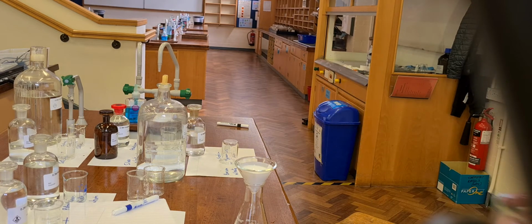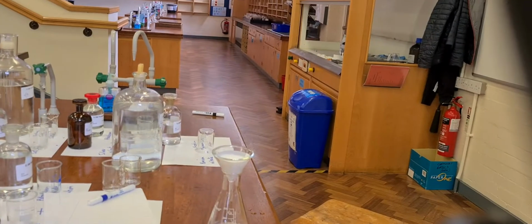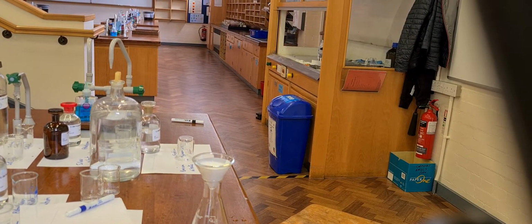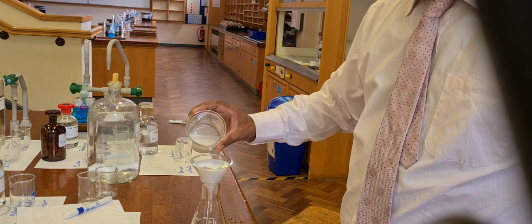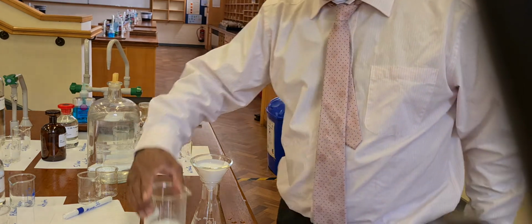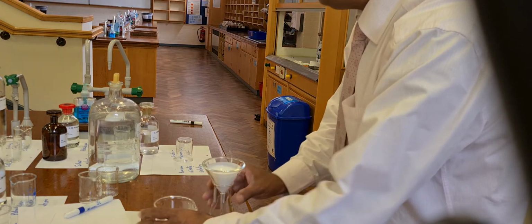And if I don't rush it, then the solution coming through into the conical flask should be perfectly colourless, because that's sodium sulfate solution, or in this case it will be, what do we use, magnesium nitrate. So normally it would be sodium nitrate solution, and in this case it'll be magnesium nitrate solution with the chemicals that I've used. Now while that's going on, we can look at other such reactions. Now, leave that there going on.